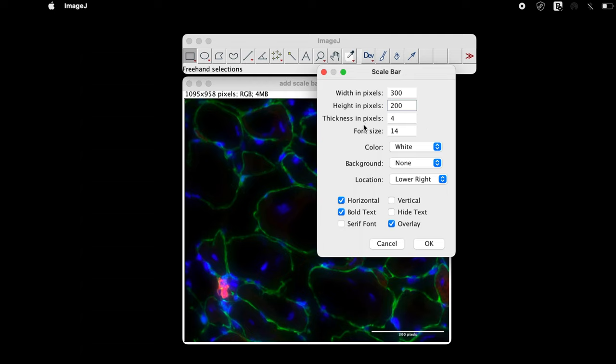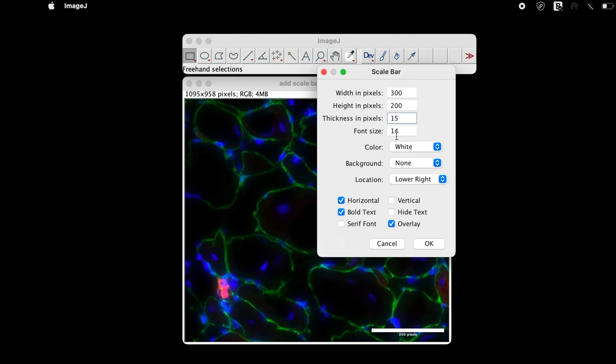The third parameter is thickness in pixels. Let us change to 15. Changing the thickness in pixels increases the thickness of the scale bar at the lower right. One can also change the font size.